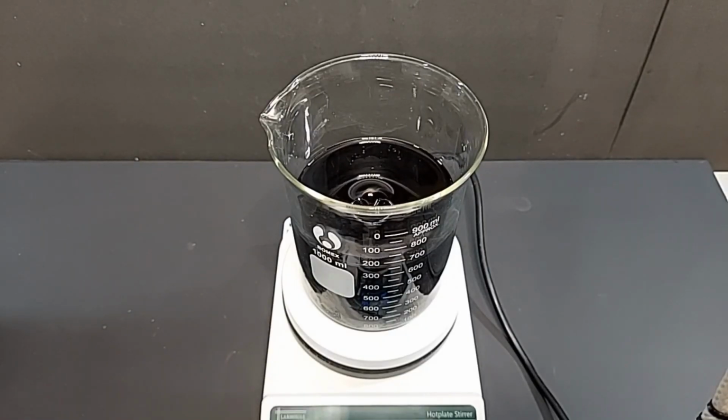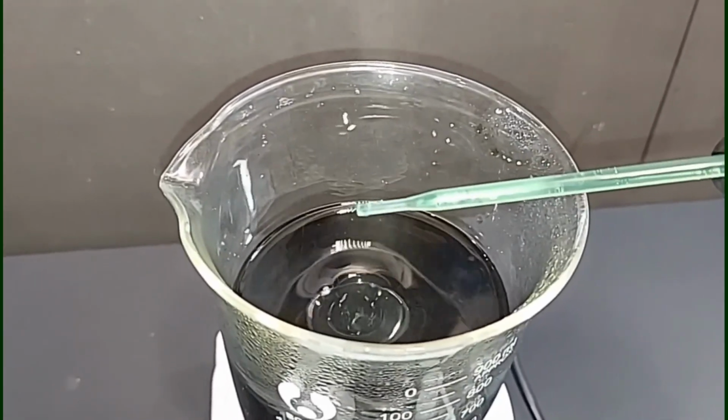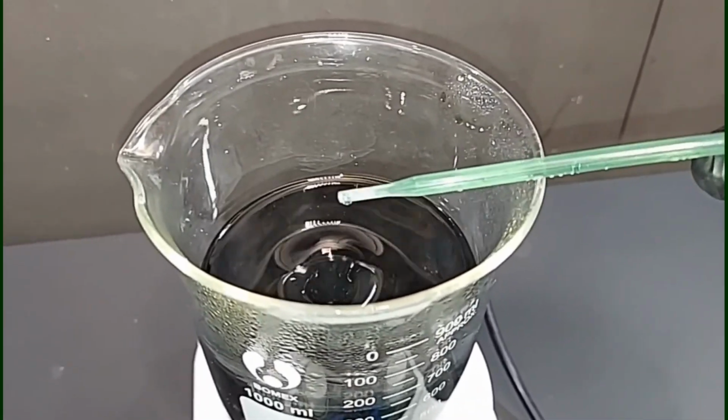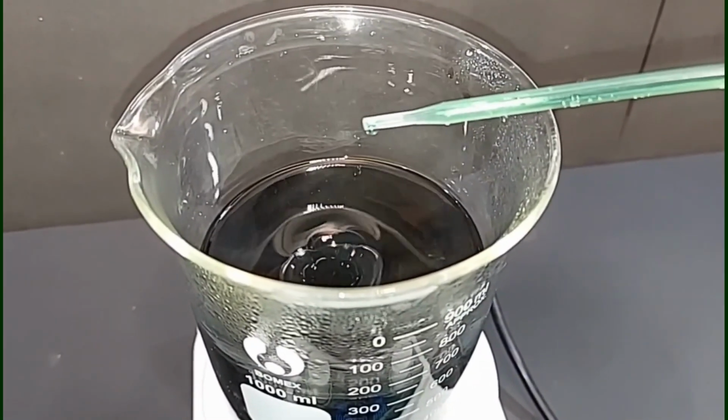Okay, I just drew this out of here, and I wanted to show you before I forgot that after adding all that distilled water, this did turn into this light green solution, which is how it should have looked from the beginning, to be perfectly honest. So it's probably going to darken a little bit as it continues to dehydrate.